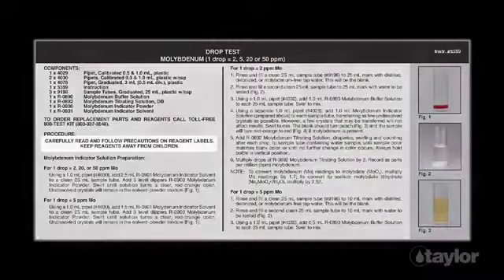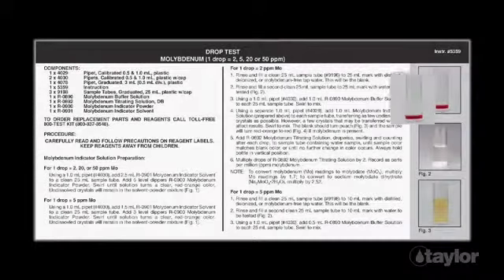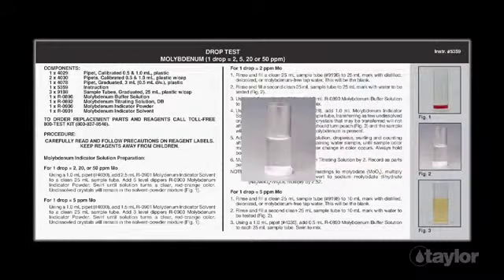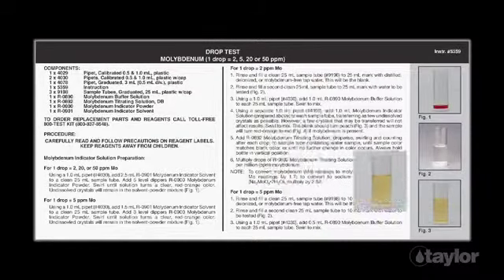Before beginning this or any other Taylor test, it is best to read the instructions through to the end. Familiarizing yourself with all the steps to come is particularly important if the test is new to you or if the kit has been newly purchased, as sometimes our procedures change.